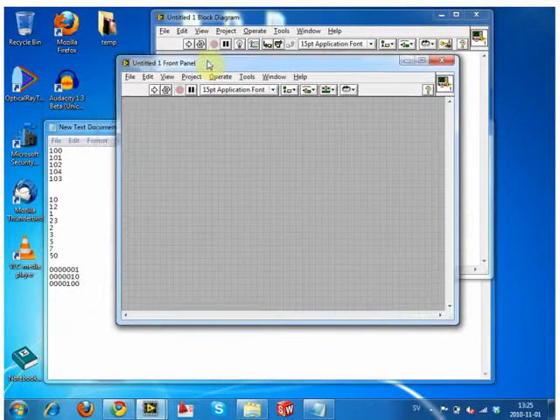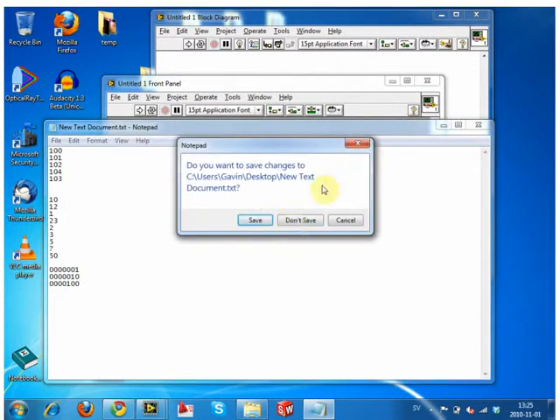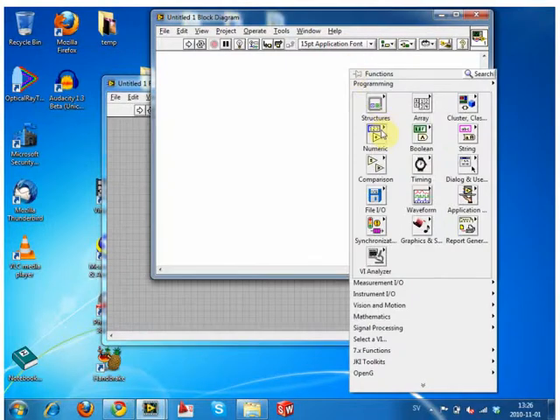On the bottom of the handout, there are two things. One is called the connector, and one is called the icon, and they're actually the wrong way around. The one on the left here is the icon, and that's what we're using to represent the VI. Just like all of these things have their own icons, we have to make our own too.